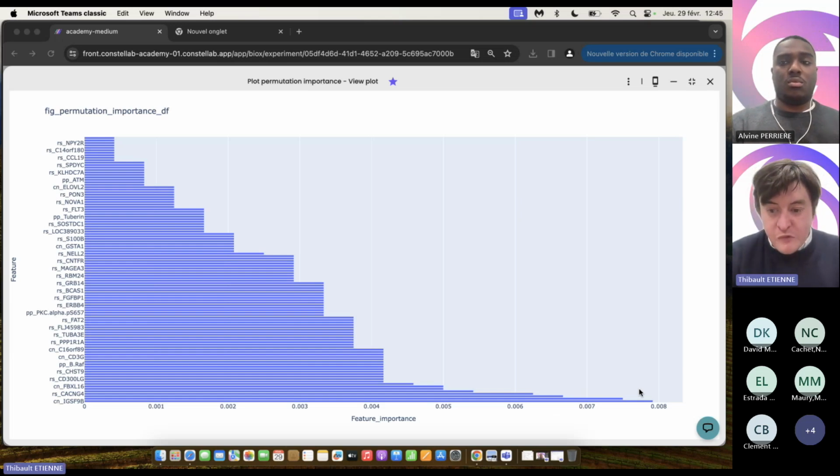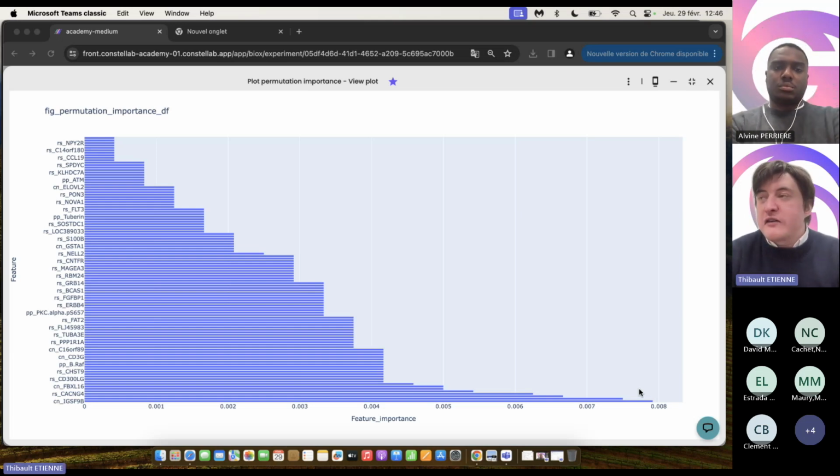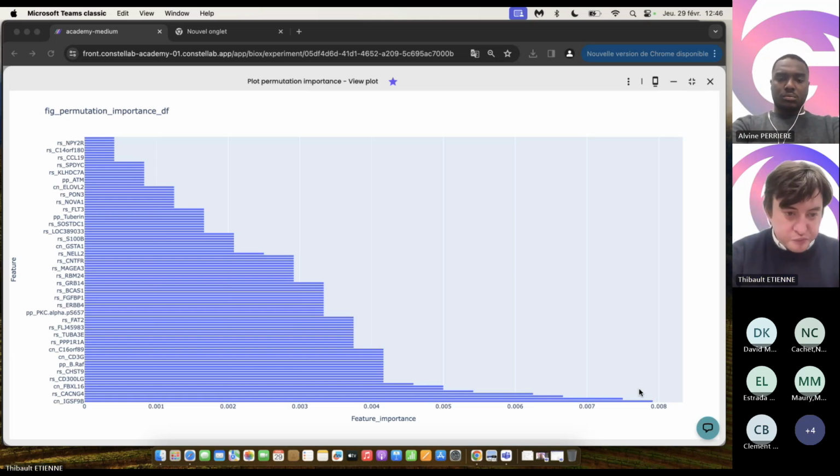It's normal. These low values are due to a high dimensional dataset, so we have many variables with no meaning behind them. Of course, these variables bias the results, but this is the idea of random forest: it is not strongly influenced by this. Okay, it's nice.